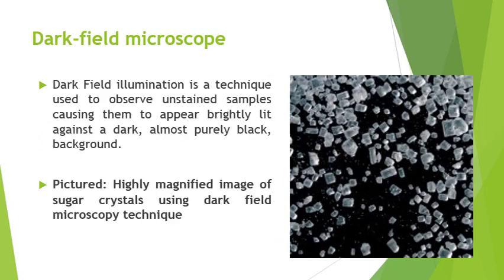So now our focus is on dark field microscope. Dark field microscopy is a type of light or compound microscopy. In this technique, we observe an unstained sample, causing it to appear brightly against a dark background.